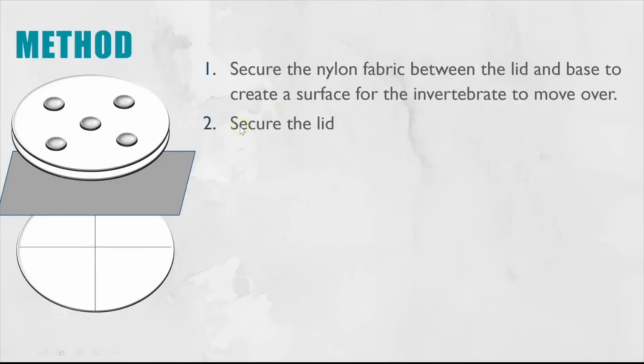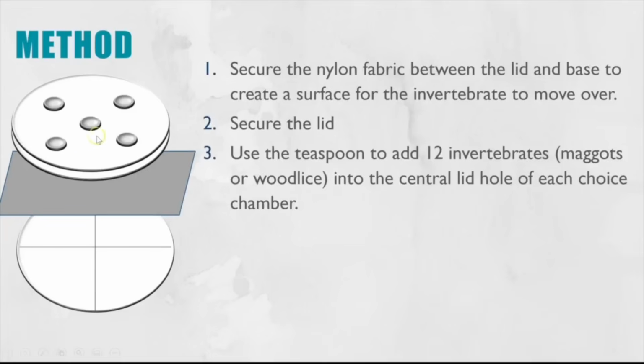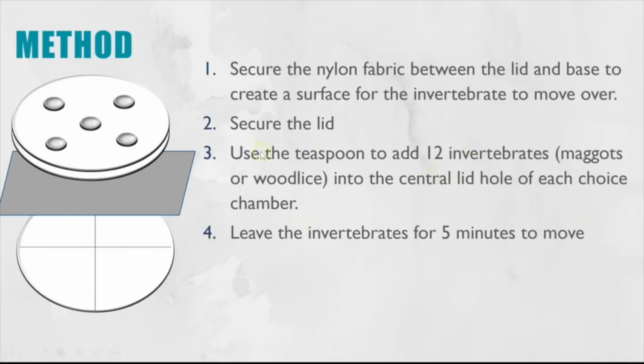So once we've got that nylon sheet, we then put the lid down and secure it shut. You then would use a teaspoon to insert your invertebrates into the middle hole, so they're right in the centre to begin with, and in this case I'm using 12 because that's what AQA suggests in their handbook. Once you've done that, you leave it for 5 minutes. You can slightly alter that time depending on your lesson length.